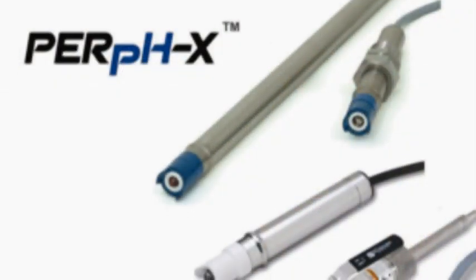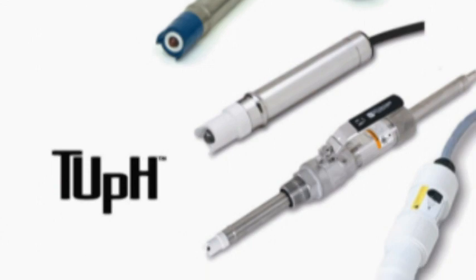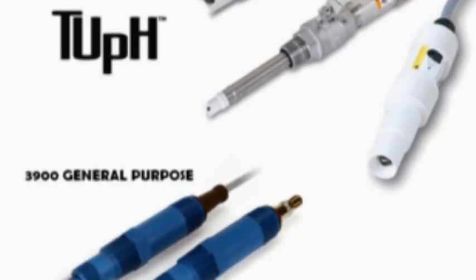Today we are going to show you how to do a two-point calibration on a pH sensor. All of Rosemount Analytical high quality pH sensors can be calibrated the same way.